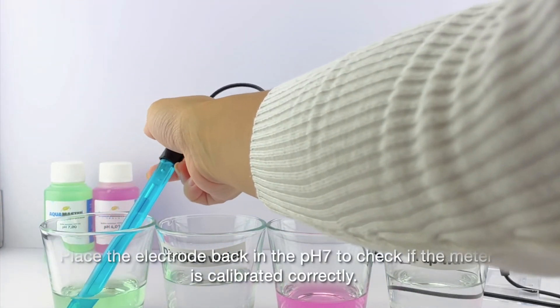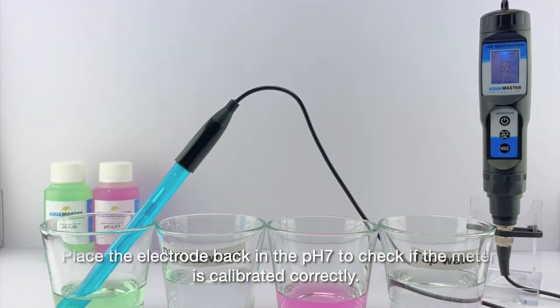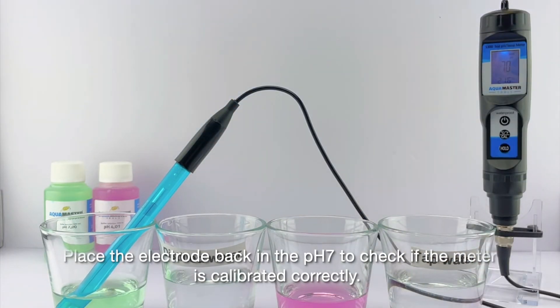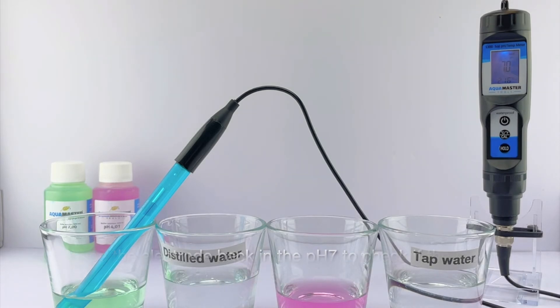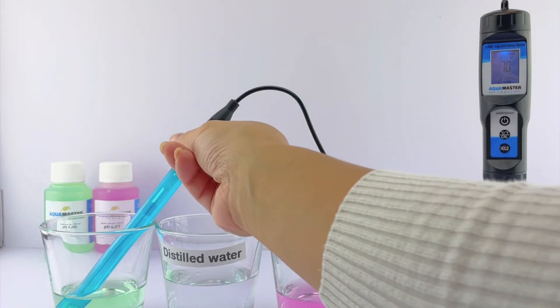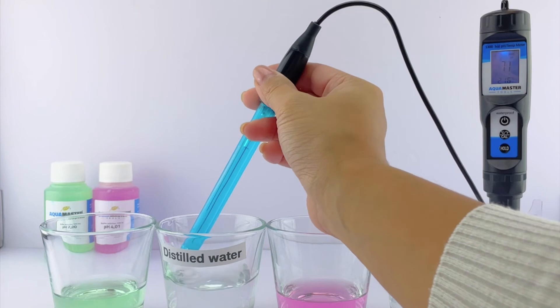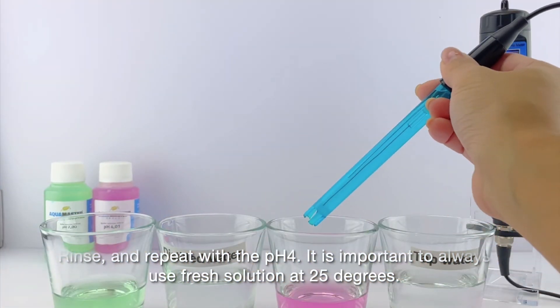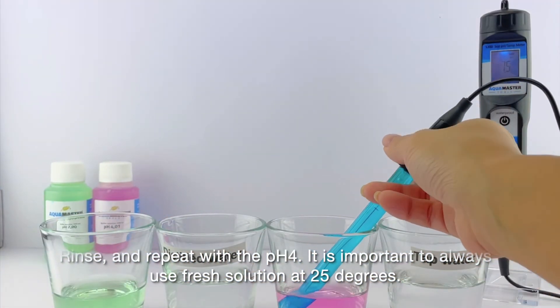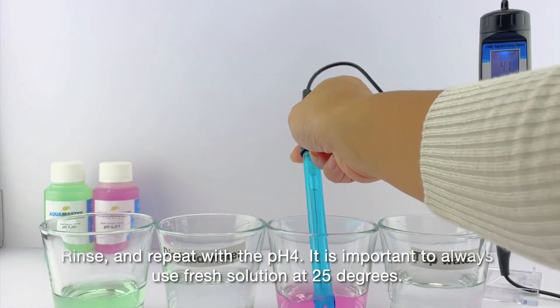Rinse the electrode back in the pH 7.00 to check if the meter is calibrated correctly. Rinse and repeat with the pH 4.00. It is important to always use fresh solution at 25 degrees.